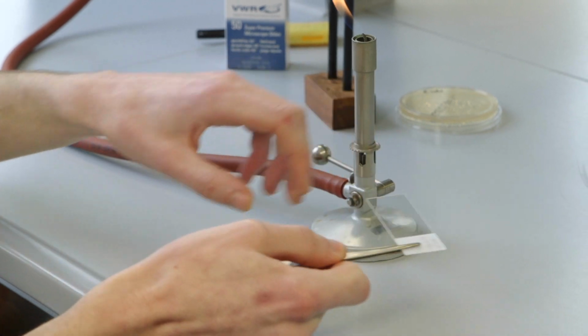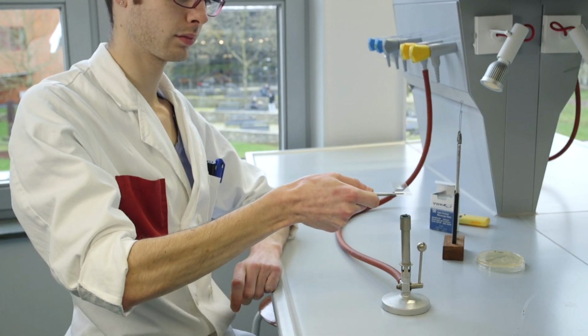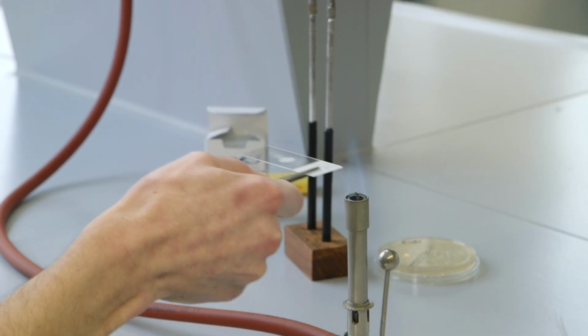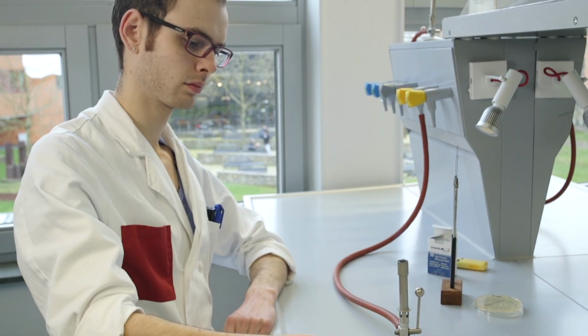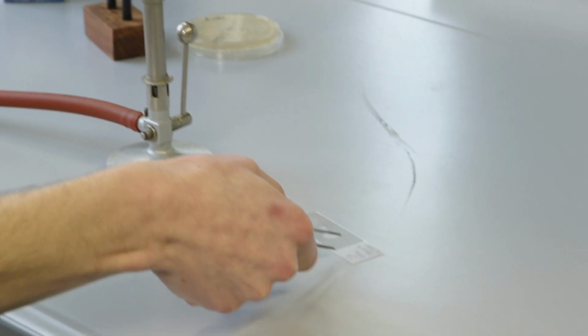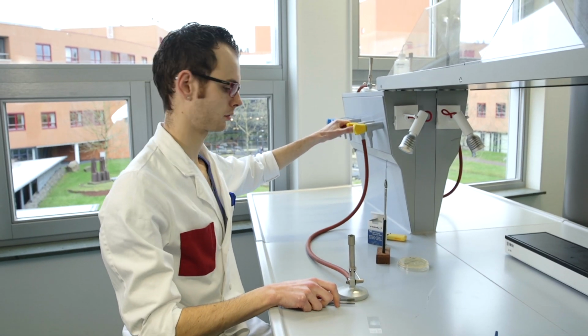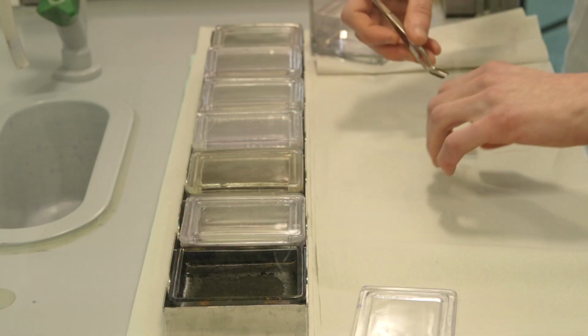When the slide is dry, the bacteria must be fixed to the slide. This is done by gently passing the slide through a blue flame 3 times. This kills the bacteria and fixes them to the slide. The heat also denatures the proteins, which helps the cells to stain better. Before beginning the staining, allow the slide to cool down. Use a tweezer to place the slides in the colour series.